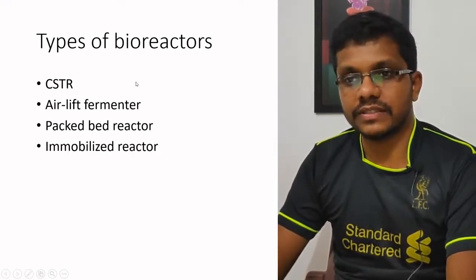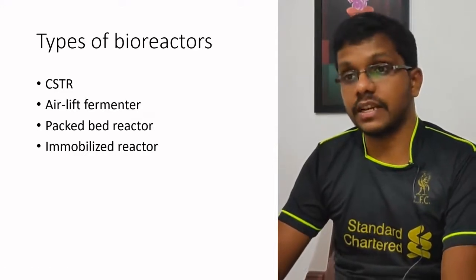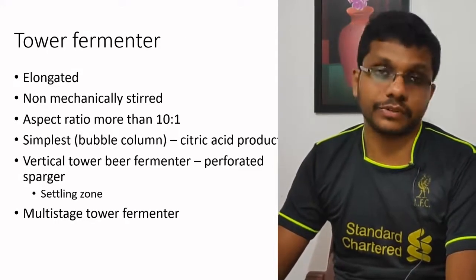So these will be covered in your seminar, so I am not going into the details of these fermenters, but I am going to talk about some other types of fermenters.